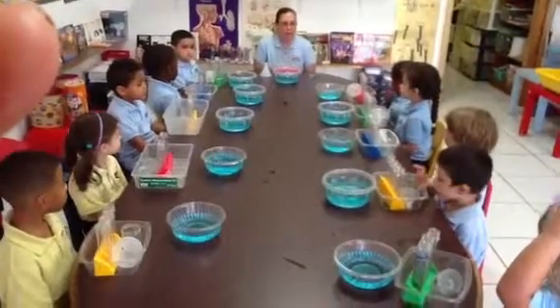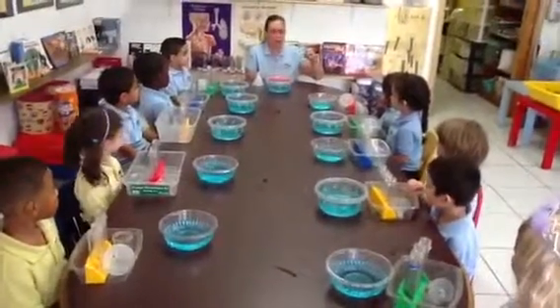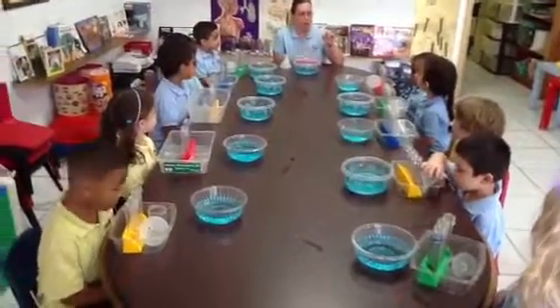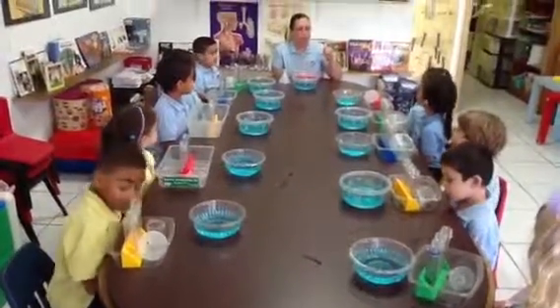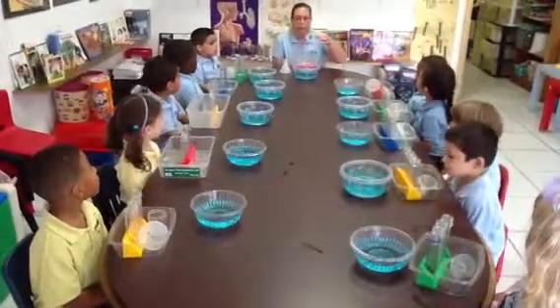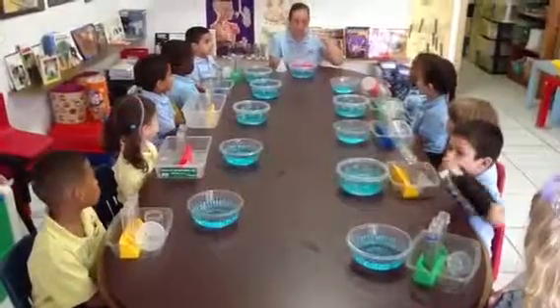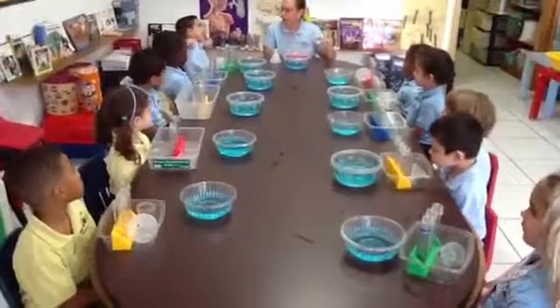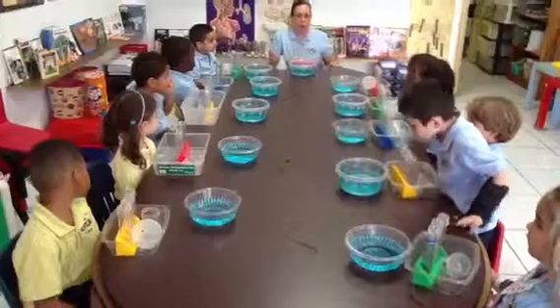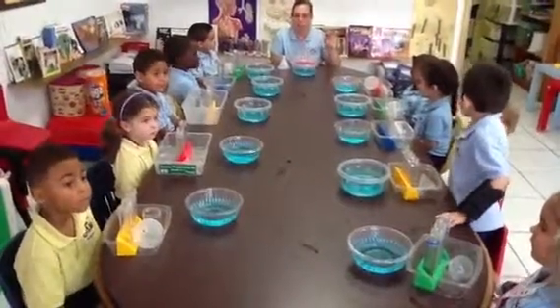We're going to talk about some things that scientists use. Today we're going to learn how to use another substance. Scientists use a magnifier to look at things.